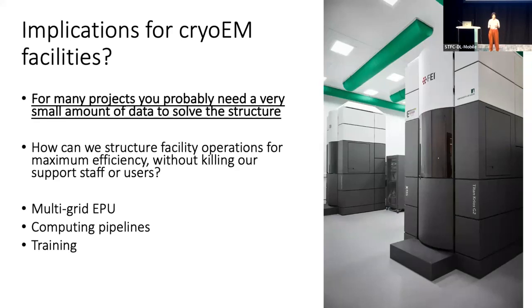And I think there are a number of tools which are either in development or coming our way, which are going to make a difference. And multi-grid EPU is something that I'm very excited about, and I think will be great, because the idea is we'll set a data collection going in the afternoon, and we'll come back in the morning to 12 mini data sets, ideally, that have all been put through the wonderful image processing pipelines that Matt presented yesterday, and it will all be highly efficient structure determination solving machines.